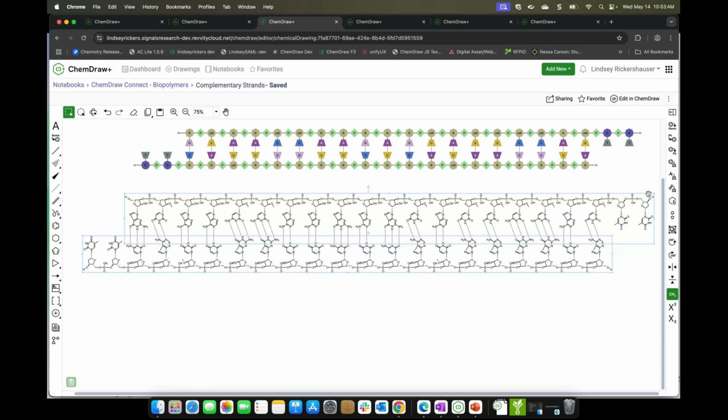Thank you. So suppose you do auto pairing with a single strand. Will that create a hairpin? Great question. Not yet. That is in the works, though. That's something that's in process, and we hope to extend in terms of the capability in the future.